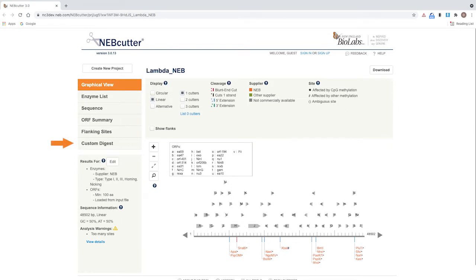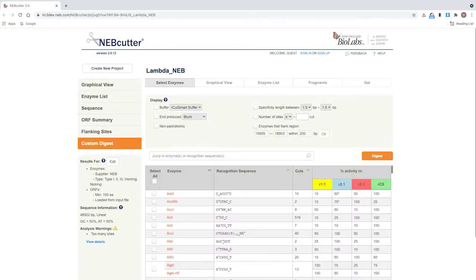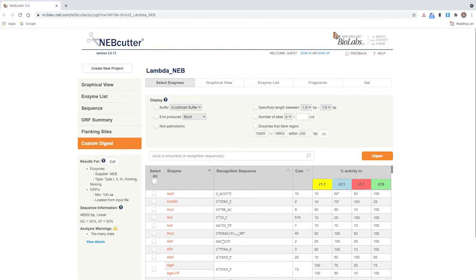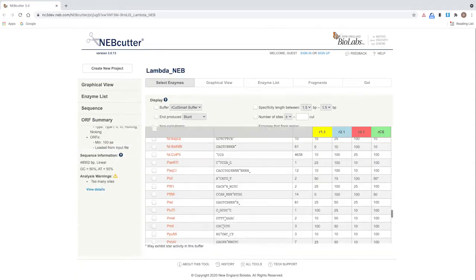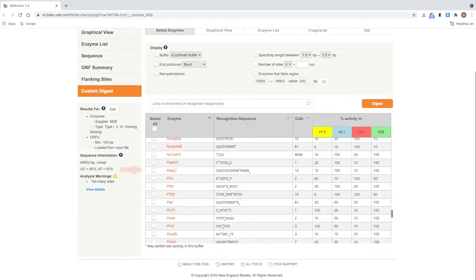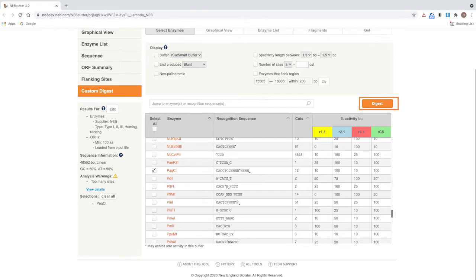Click Custom Digest. You can search for a specific enzyme by name or scroll through the list to find it. Select PacI from the list. Click Digest.